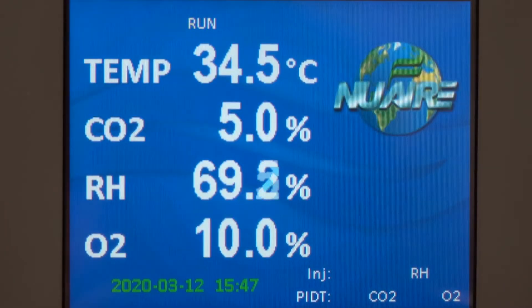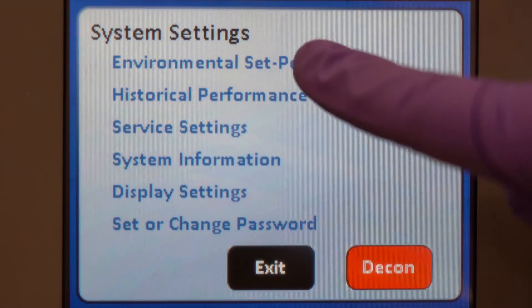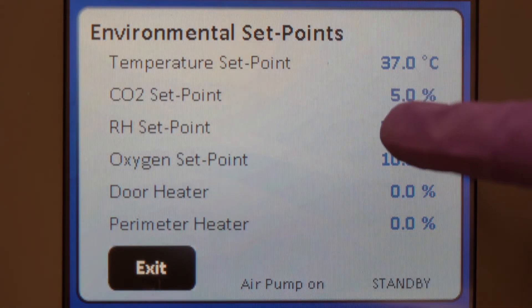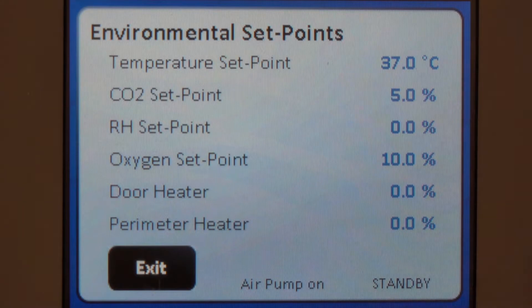Begin by configuring the special settings. First, change the actively controlled RH setpoint to zero. Next, change the oxygen setpoint to 21%.